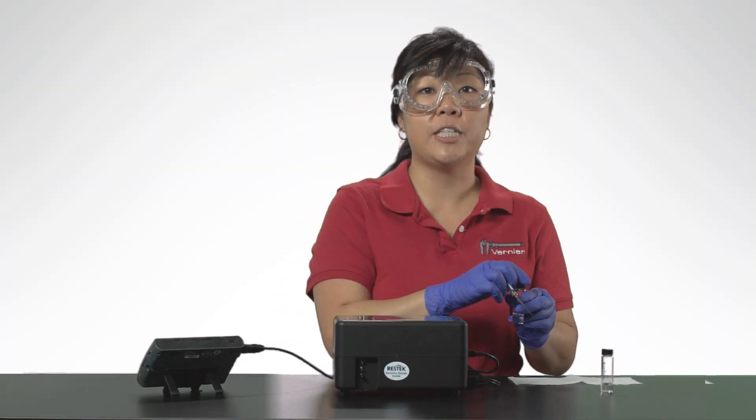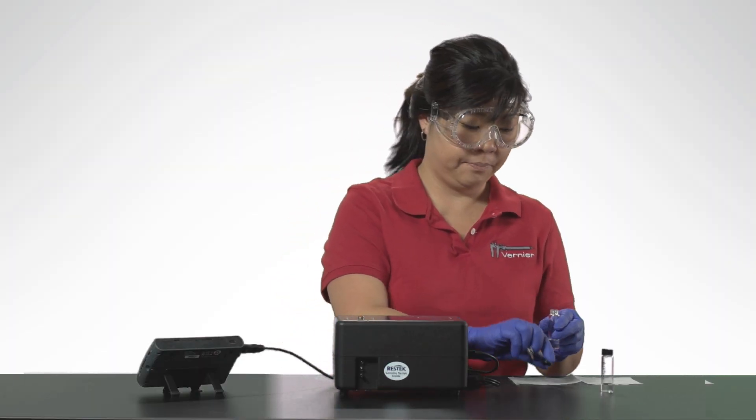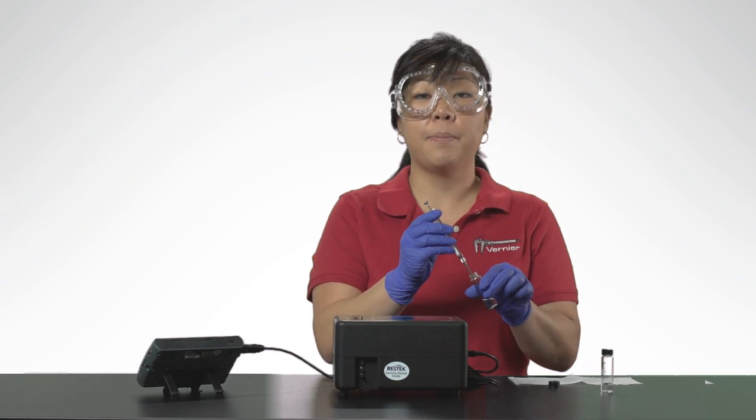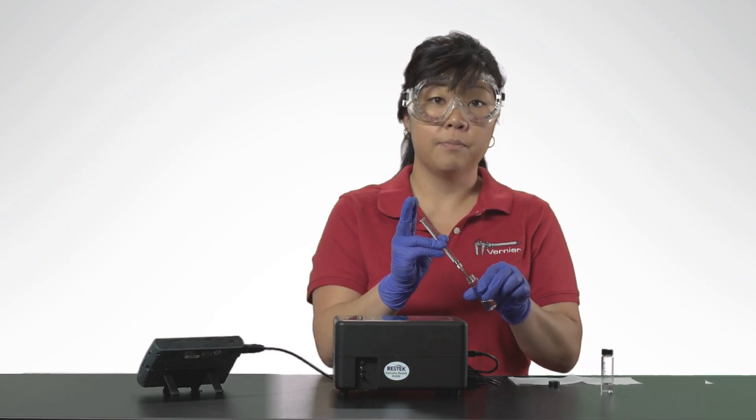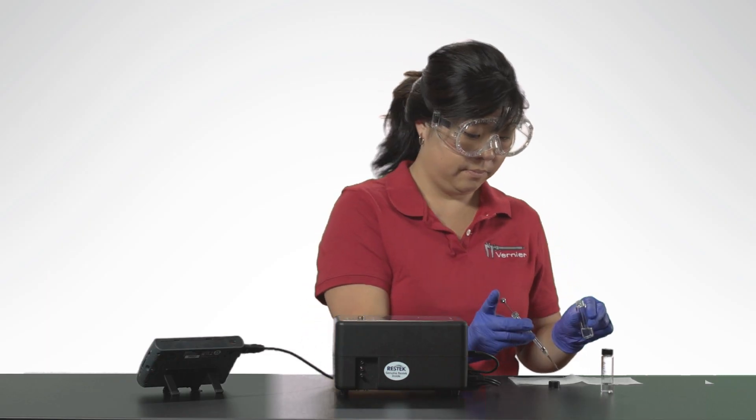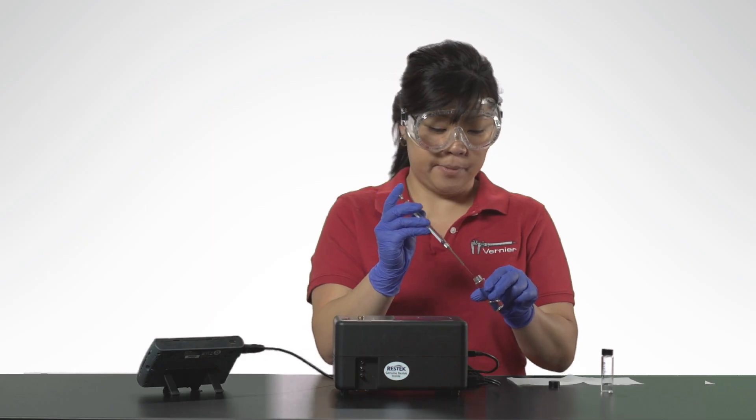Submerge the tip of the needle into the vial containing the sample. Pull back the plunger to fill the barrel about one third full. Expel the liquid onto a paper towel. Repeat this process two more times.